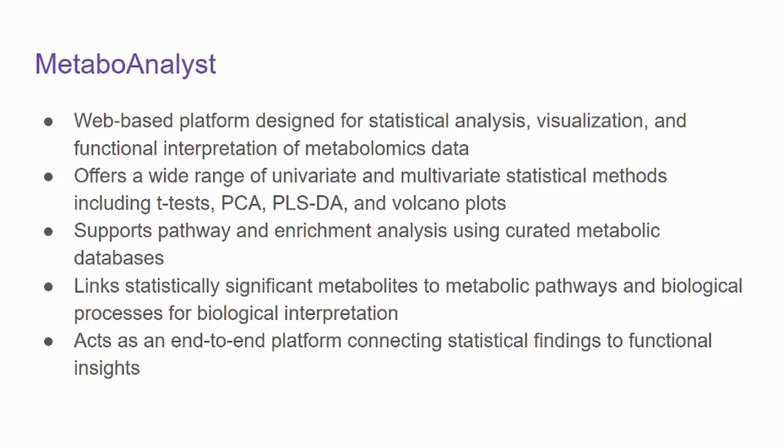It can visualize all the graphs, and we can do univariate and multivariate statistical testing like t-test, PCA and everything. There is also an option to do pathway enrichment analysis. So all these things you can do in MetaboAnalyst. And MetaboAnalyst is one of the most widely used statistical testing softwares for metabolomics, so it is very trustworthy.